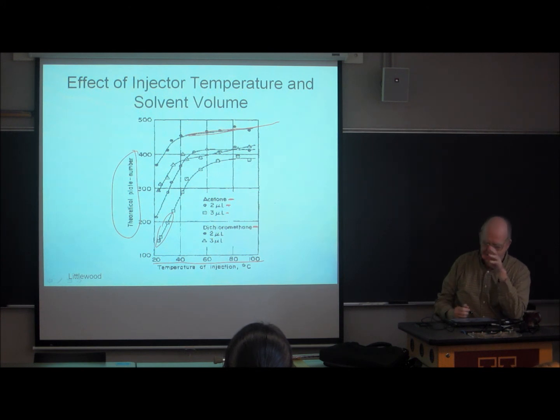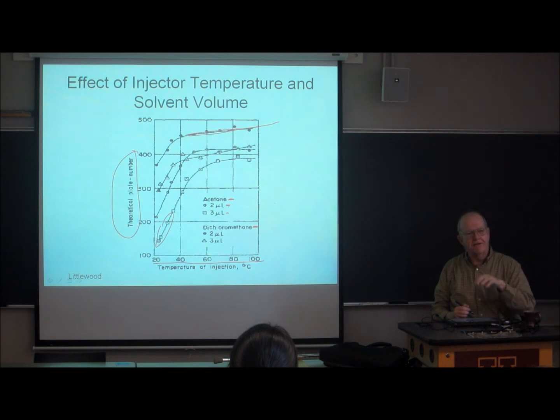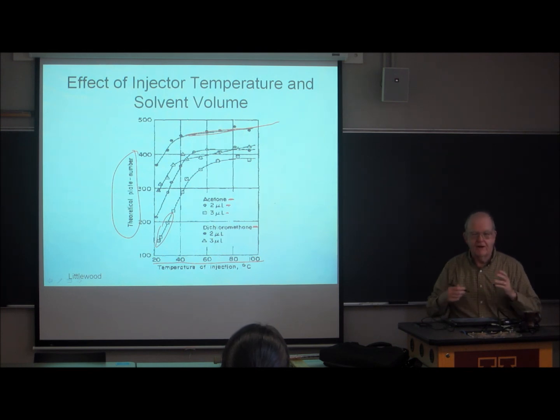So generally speaking, your injector is at the highest temperature of any part of your chromatographic system. And it's not uncommon to have the injector at 200, 250, even 300 degrees, if your analyte can handle those high temperatures. And this is probably the biggest limitation of gas chromatography.